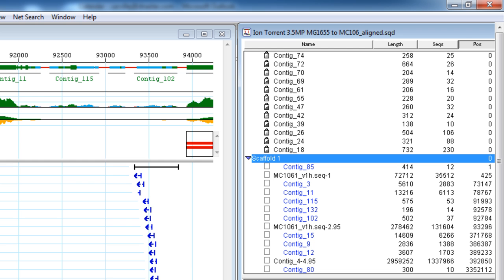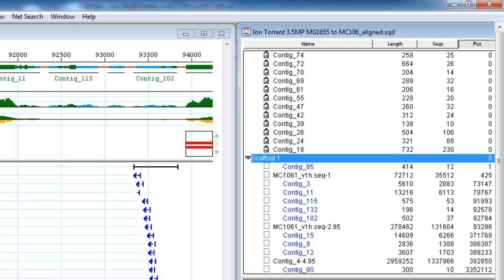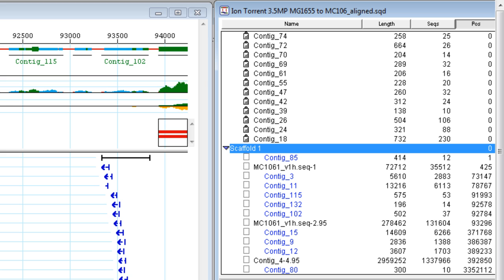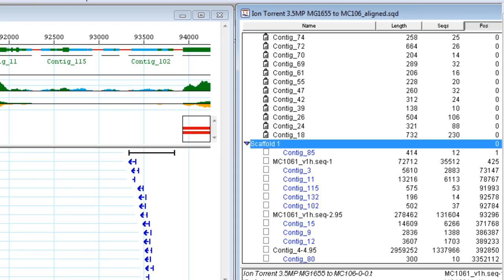These low-coverage contigs can be identified in two different ways. One way is to compare the contig length to the number of reads within the contig. For example, here in contig 85, we only have 12 reads per 414 bases, qualifying as a low-coverage contig.